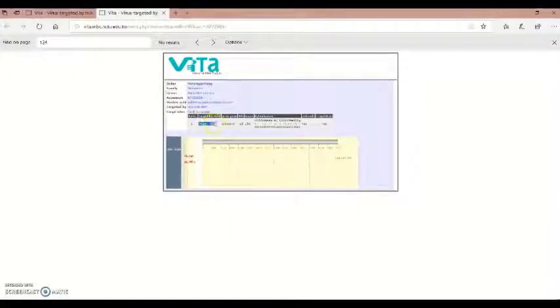So our target location is specified here, and the virus gene is unknown, but thankfully to previous research we know that this is a region coding for the glycoproteins. So here we have a minimum free energy of -15 and a Miranda score of 156.